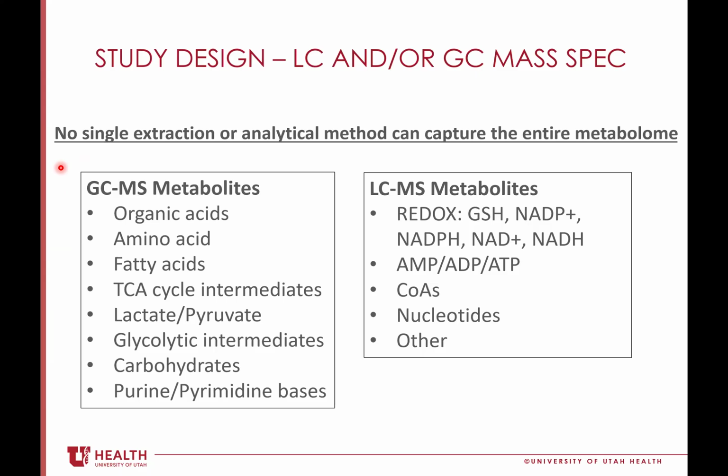C6H12O6 is the molecular formula for glucose, but it's also the molecular formula for about 30 other carbohydrates. And using GCMS, we're able to separate all those different carbohydrates from each other and get an identity for galactose and a number of those other isomers.